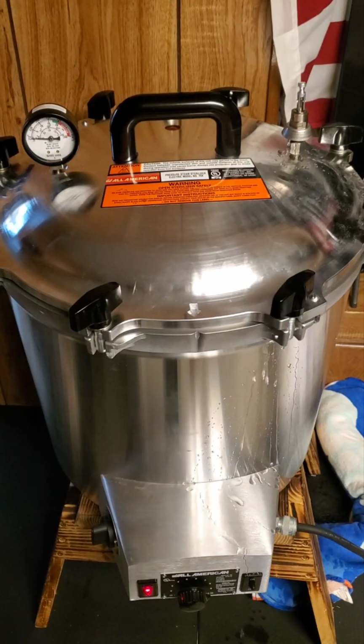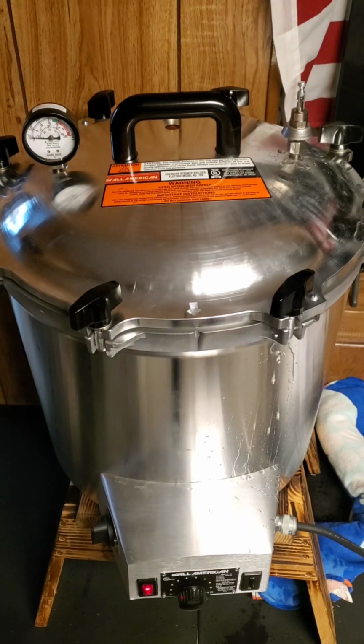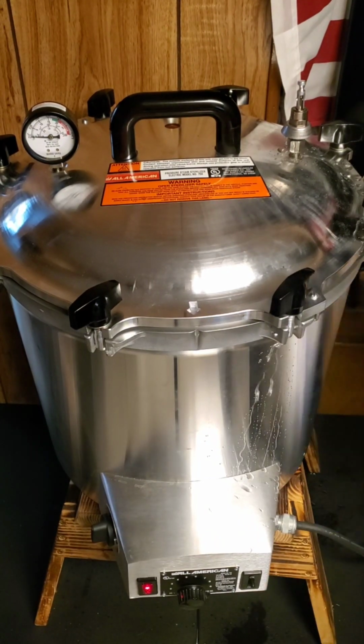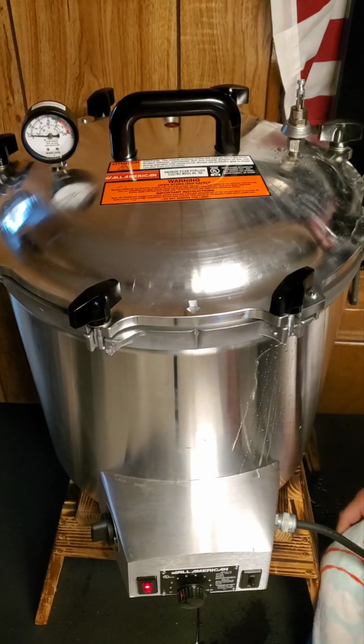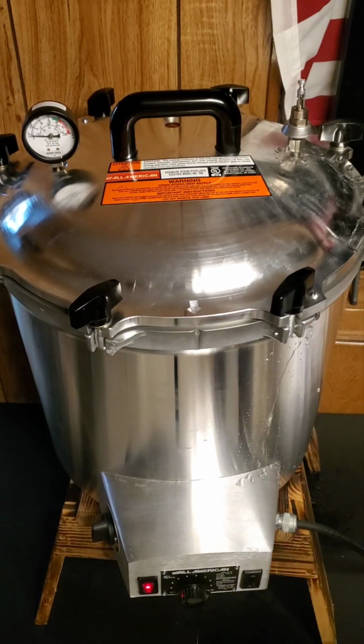All right, so just started doing this. It's been kind of making noise for a second. The water just started coming out. So this is what I consider steaming for 5 minutes. All right, even at less than half, it's still got a lot of moisture. I'm going to take this towel.